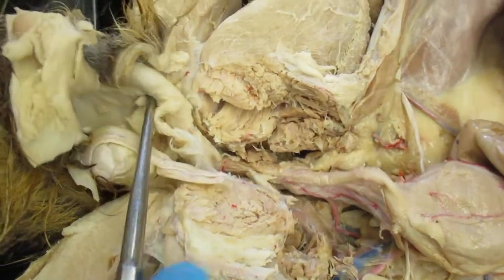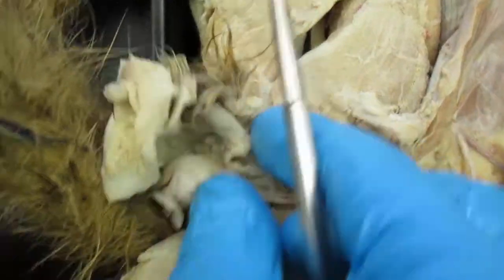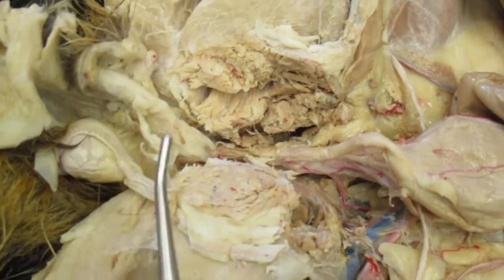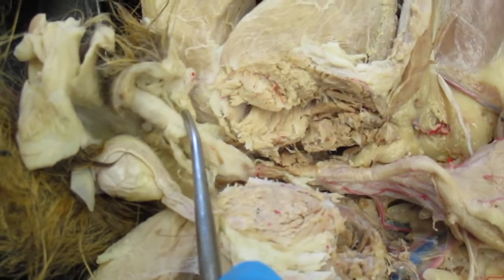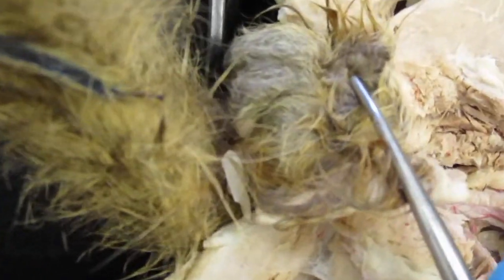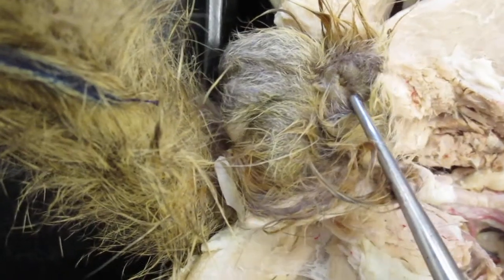Here's the penis right here. Penis right there. Okay? And then I've already showed you the urethra opening right there of the penis. Okay?